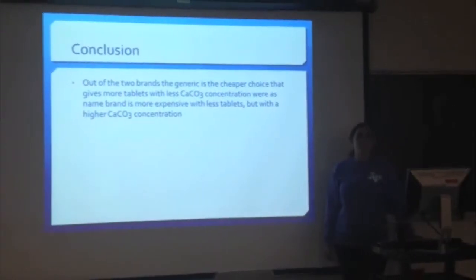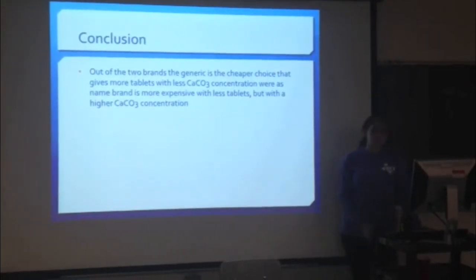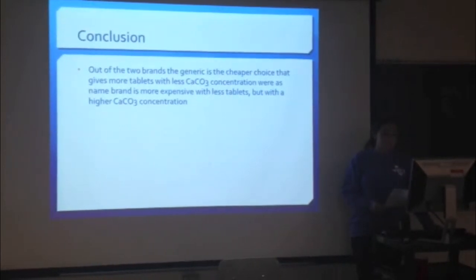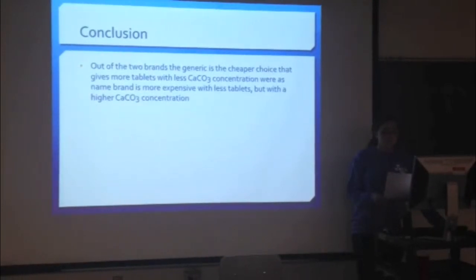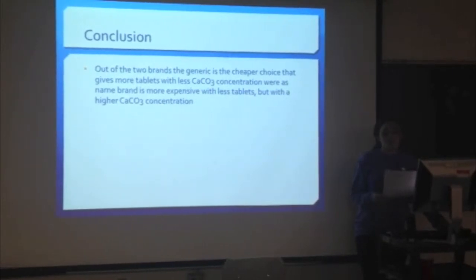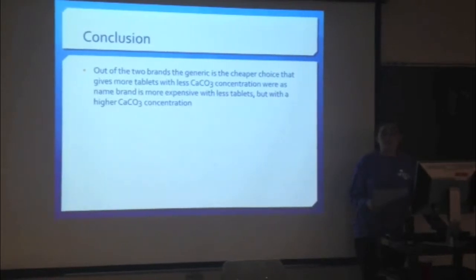After the conclusion, we listed our pros and cons. Something you need to watch out for when doing titration labs, you need to make sure you read the directions thoroughly. You need to make sure that you will have little room for calculation errors. The phenolphthalein is a sensitive pH indicator, and the pink antacid tablets are hard to tell with your phenolphthalein.